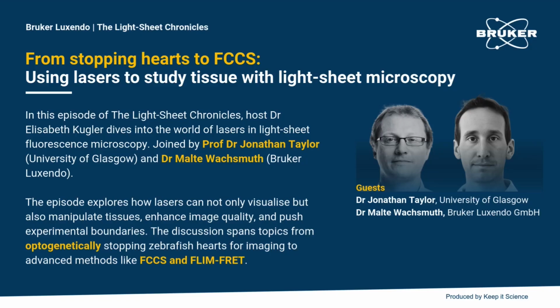Absolutely. And Johnny, what about you? Is it the tension sensors? So on a specific level, absolutely. I'm super excited about the tension sensors and the potential for using those as an in vivo probe. But I think more generally, along the lines of what Malte was saying, for the field as a whole, what I'm excited about is that where we are now with light sheet microscopy, you don't need to be an optics expert to use these systems and to benefit from them.